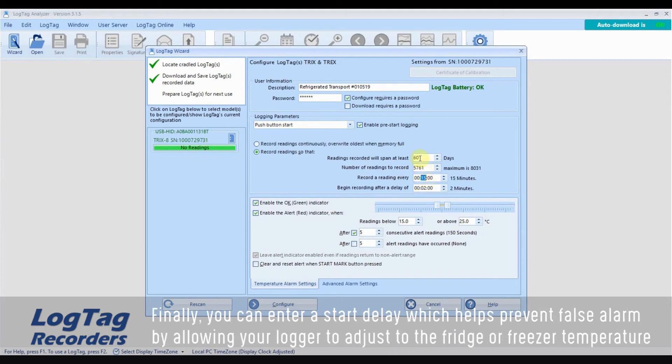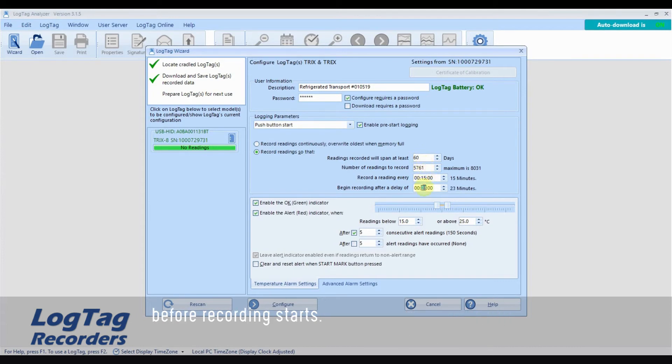Finally, you can enter a start delay which helps prevent false alarms by allowing your logger to adjust to the fridge or freezer temperature before recording starts.